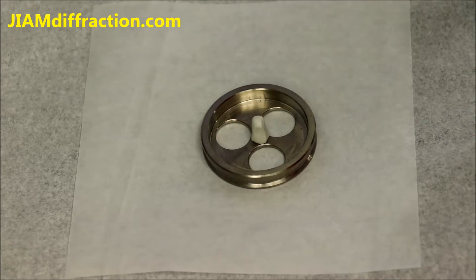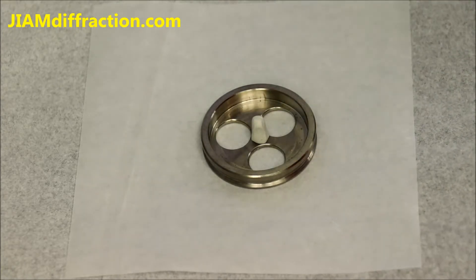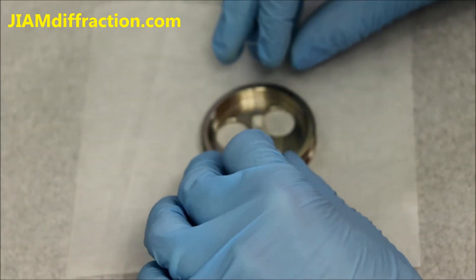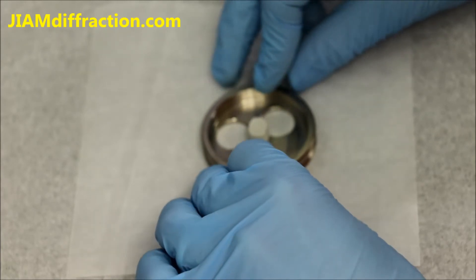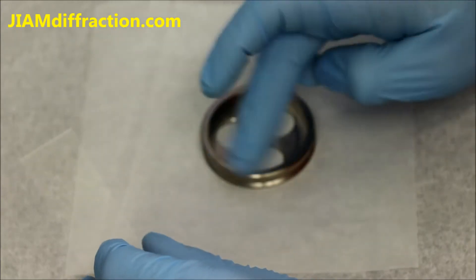Here we have the sample holder. In the center is some putty. The first step is to use a glass slide and just press down on the putty. This makes the surface a little bit flatter and more level with the outside ring.